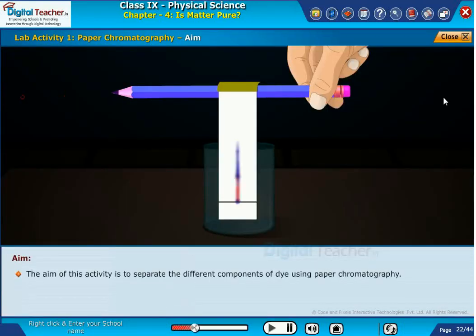The aim of this activity is to separate the different components of dye using paper chromatography.